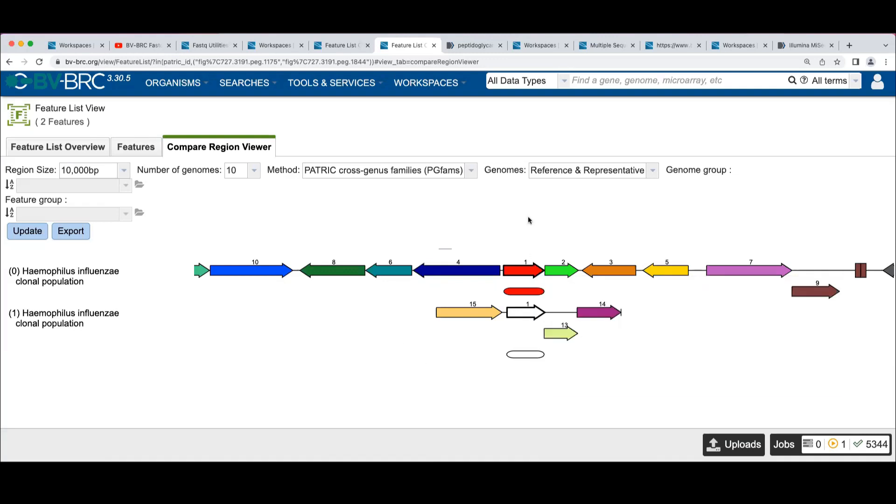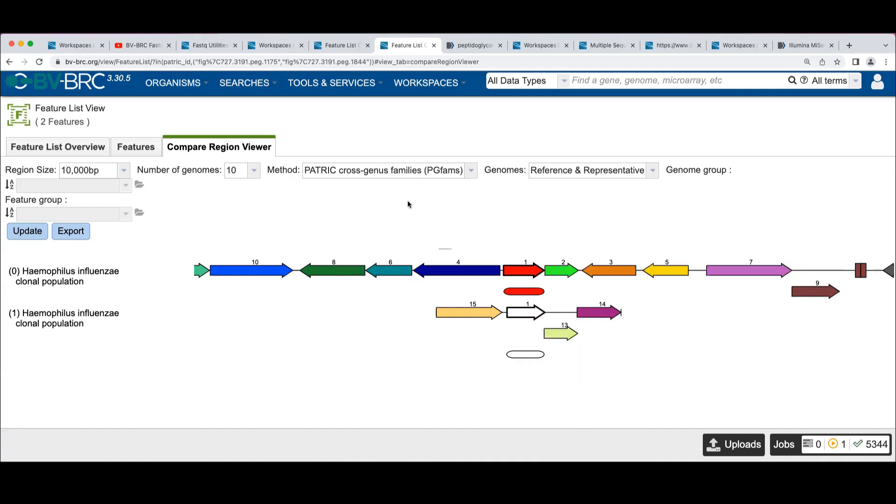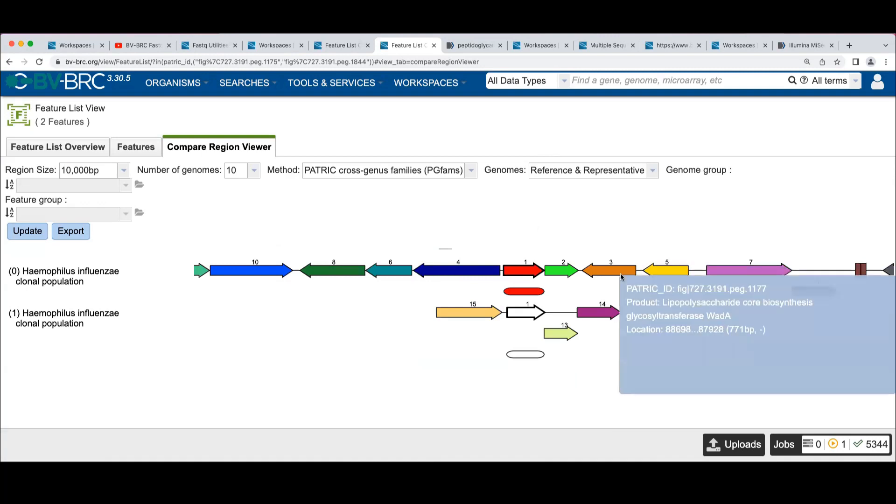And so the way to read this display is that the red gene is what we call the focus. And we came in on this gene. And these are colored by function. So two arrows of the same color will have the same function.